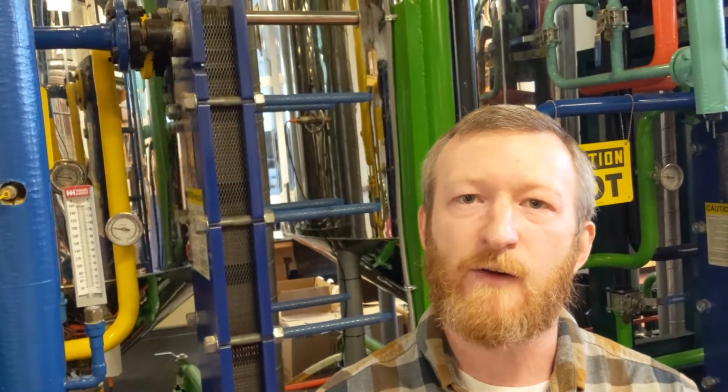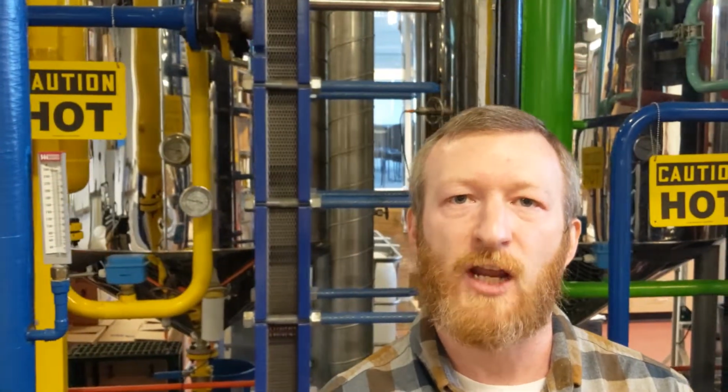What's happening during this reaction, the reaction is called transesterification. What's happening is the glycerin backbone that's holding on to three fatty acid chains, forming a triglyceride molecule, we're removing that glycerin molecule. We're stabilizing those free fatty acid chains with a methanol grouping, and then the glycerin is separated and free. It's more dense than our newly formed molecule. The new molecule is fatty acid methyl ester, which goes by the common trade name biodiesel.